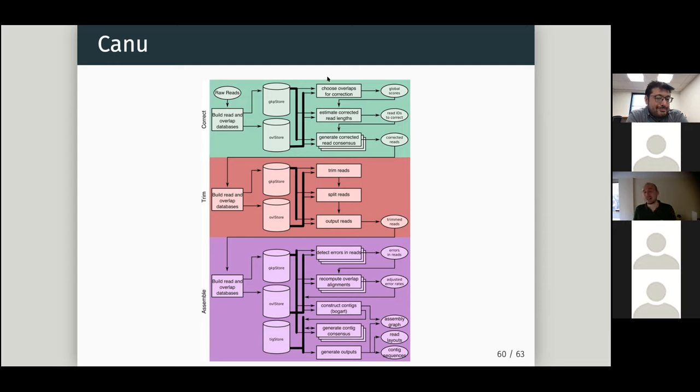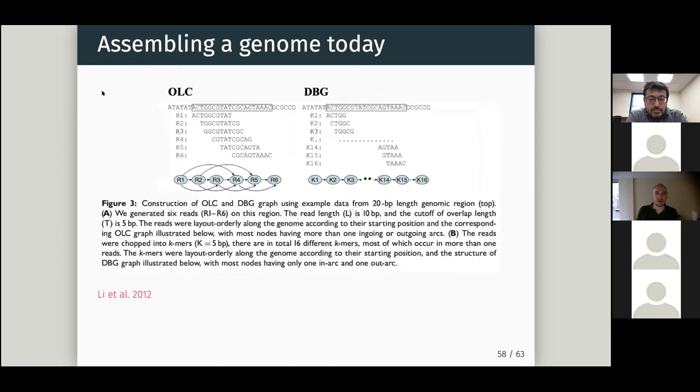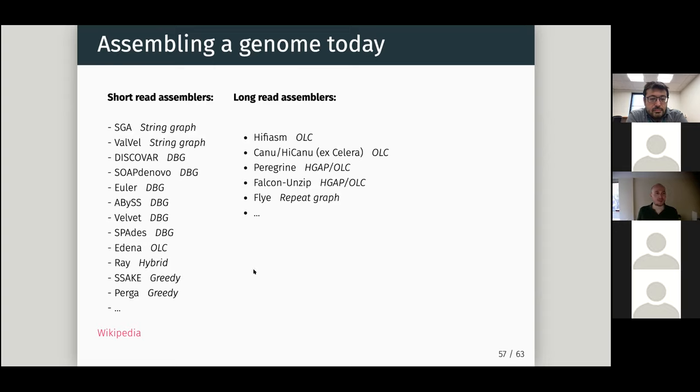No, okay. Well, so I listed many tools. Let me go back to that first. This is not exhaustive, so there are many more tools. I would say that all core bioinformaticians at some point will try to develop their own algorithm. I haven't, because I'm not a core bioinformatician, but especially with Illumina, there were a lot of them. Again, the strengths and weaknesses of each one of them, I don't know them. It depends on the problem, on the assembly. For long read sequencing, at this point, the list is not as long. If you have HiFi reads, you want to go for hifiasm, which is developed by the Heng Li group. Heng Li also developed BWA, to give you an idea. Of course, if you are good at aligning reads, you're probably good at also creating genome assembly algorithms.